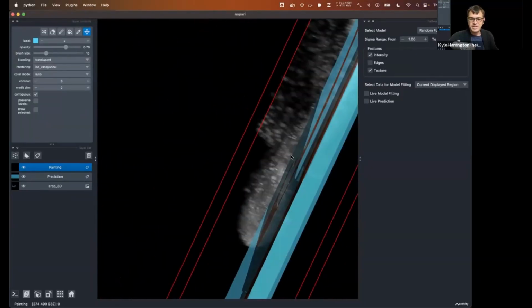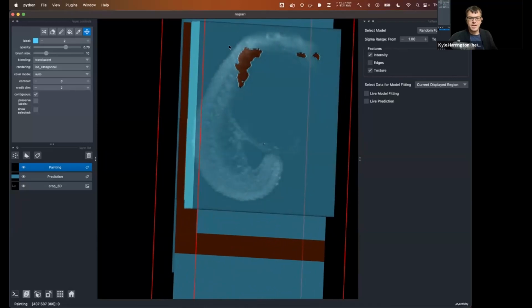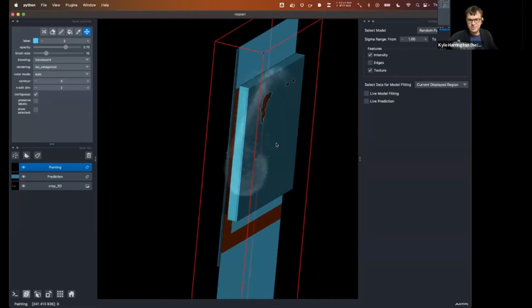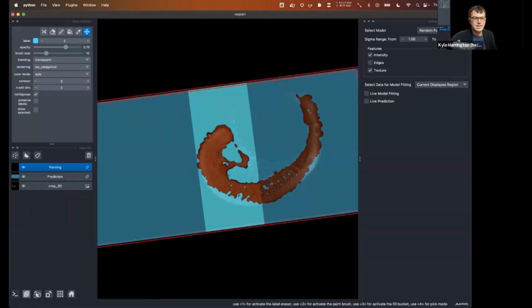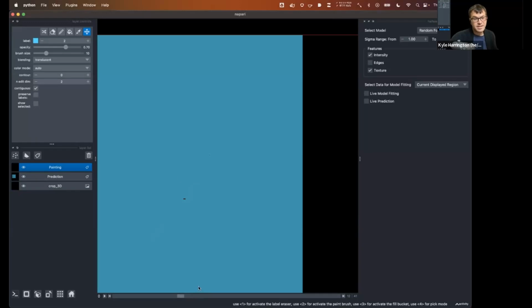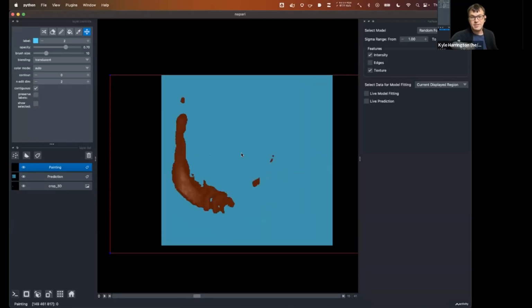And so we can keep going. You can see clearly where what I was viewing on the screen, clearly not the whole image, but I was capturing the zebrafish. And I can basically go on from here.